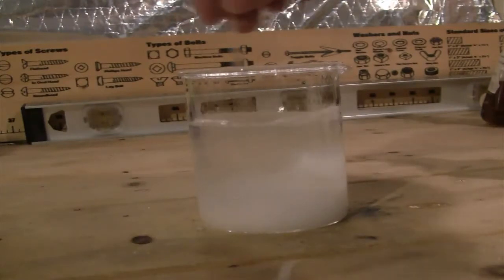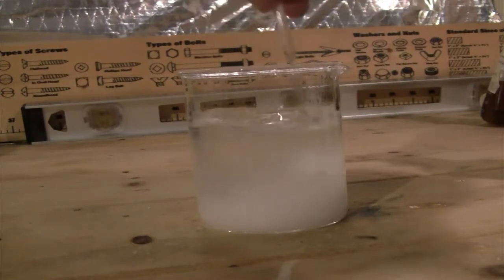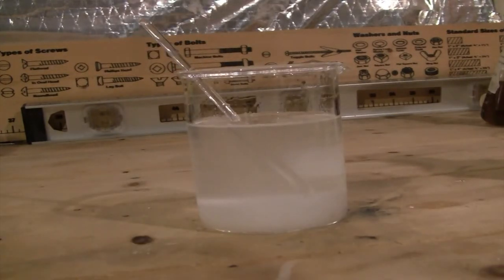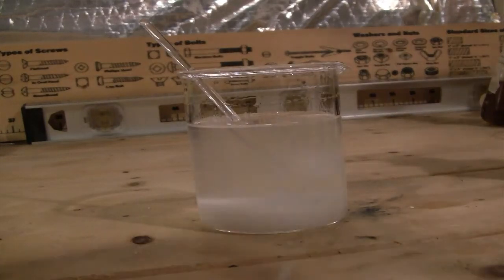I then stirred the mixture and added a little more salt to draw out more water. I finished with another stir and allowed the mixture to sit and settle before decanting off the top organic layer into a labeled bottle.